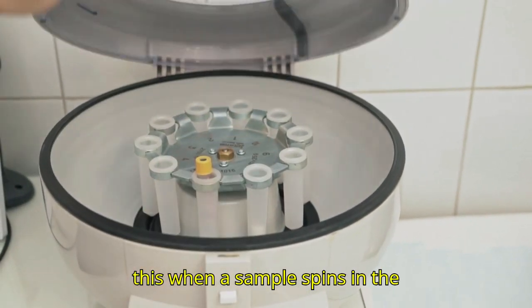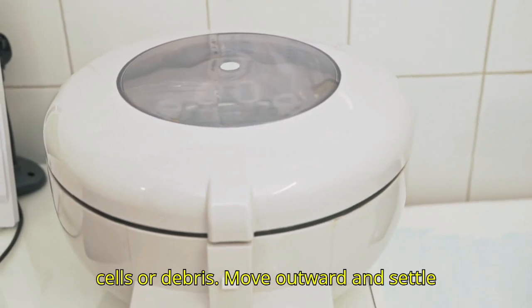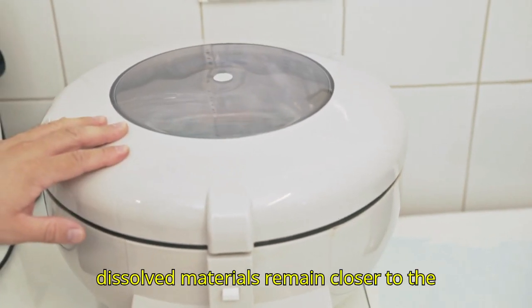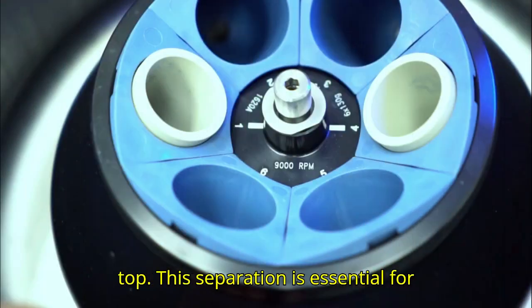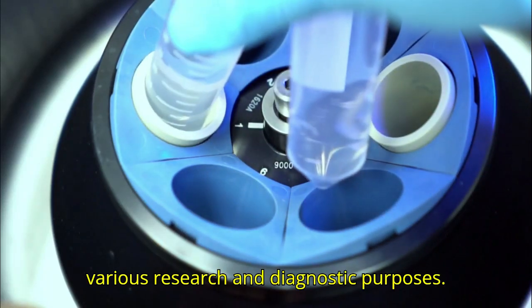Picture this. When a sample spins in the centrifuge, the heavier particles, like cells or debris, move outward and settle at the bottom, while the lighter, dissolved materials remain closer to the top. This separation is essential for various research and diagnostic purposes.